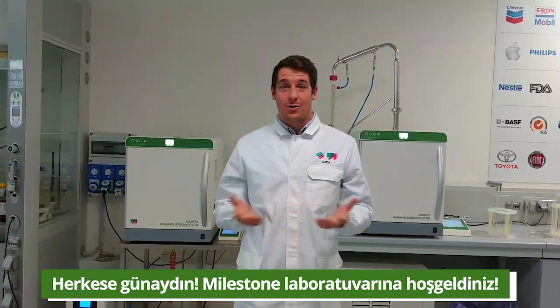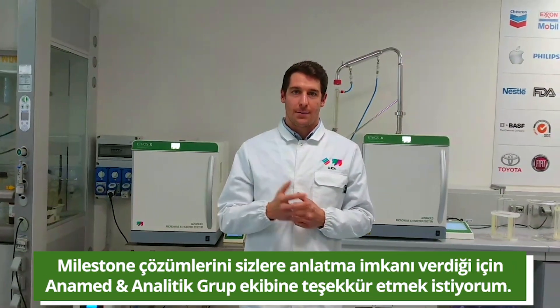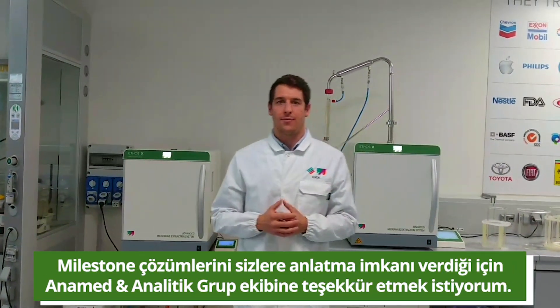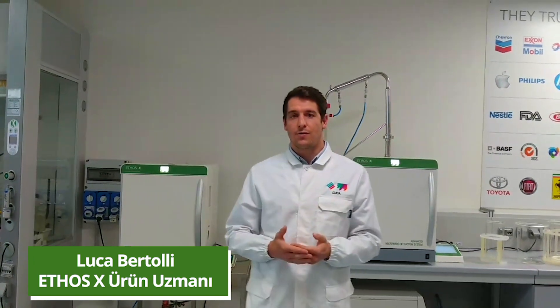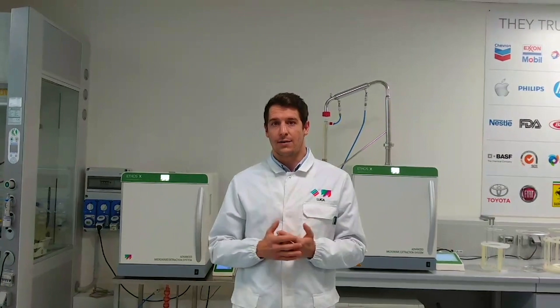Good morning everybody and welcome to Milestone Laboratory. First of all I have to thank the Anamed & Analitik group for this event and for giving us the opportunity to show you Milestone solutions. My name is Luca Bertoli and I am product specialist of the ETHOS X platform dedicated to soft and solvent-free natural extraction.